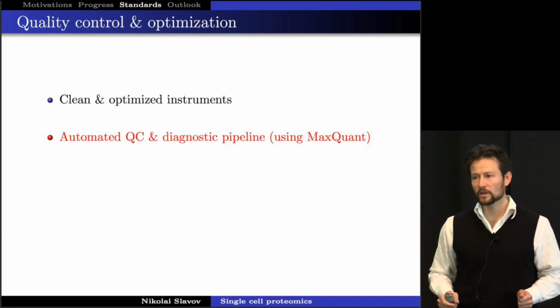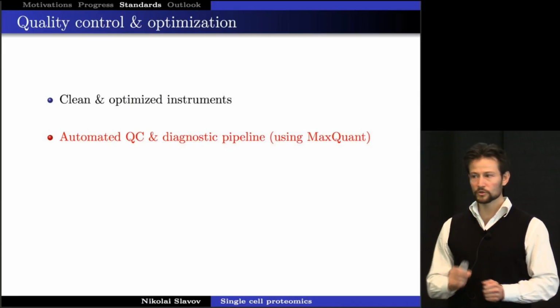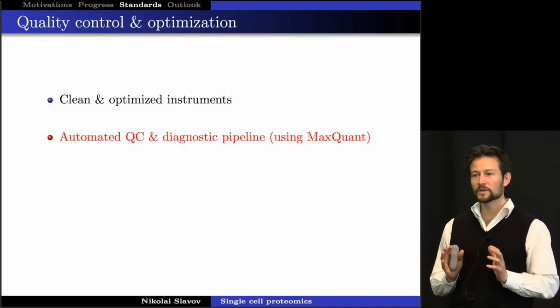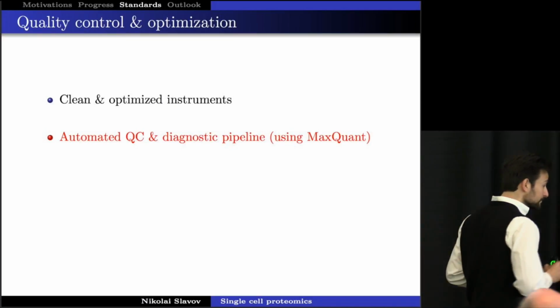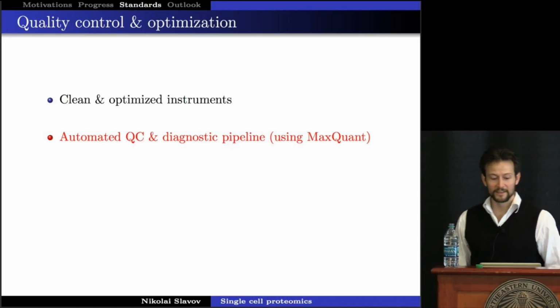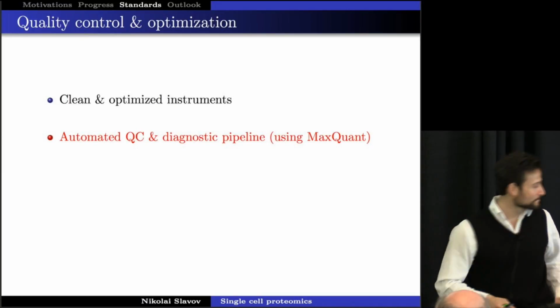Was it incomplete injection? Was it apex? We failed to sample the elution peaks at the apex. Did we have contaminants? Were these +2, +1 contaminants? So it was remarkably useful. And I truly feel like that guy, having spent, it's humiliating, but I've done a year of this. And I'm much, much happier now that we have this pipeline.